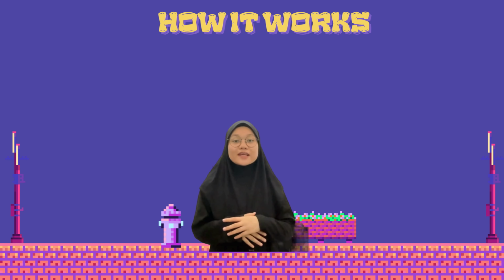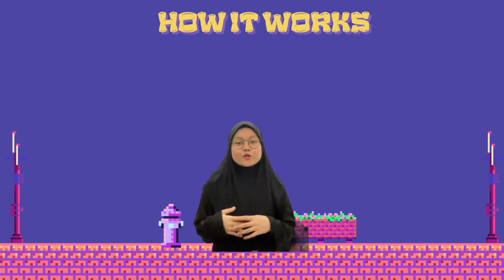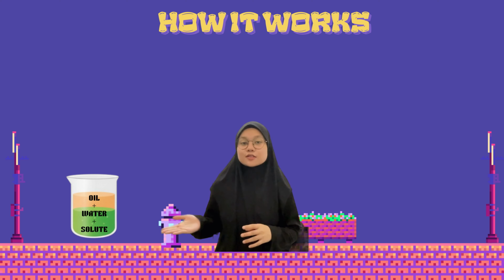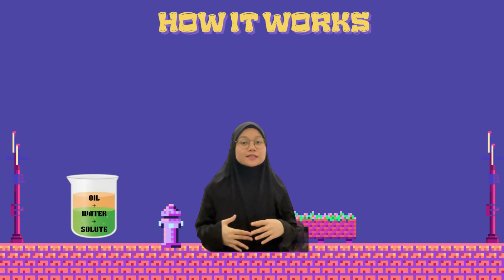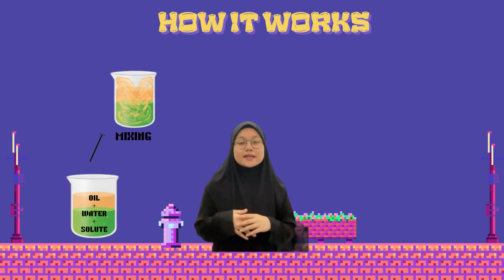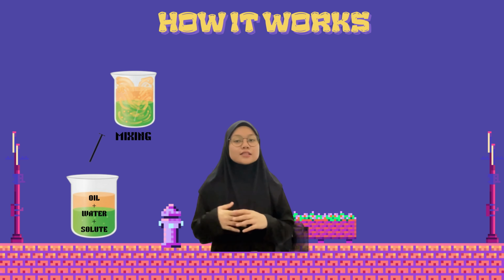Let's walk through the basic steps of liquid extraction, a process used to separate compounds using two immiscible liquids such as oil and water. We begin with a mixture that contains oil, water, and a solute. These liquids do not mix, and the solute is looking for the liquid where it dissolves the best. Next, we stir the mixture. This allows the solute to move freely between the two layers, searching for the one where it is more soluble.